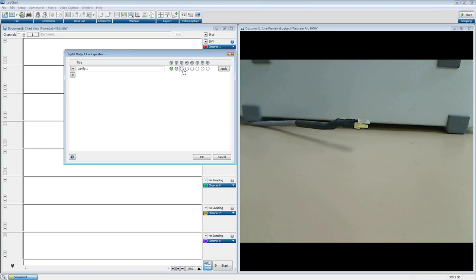Whenever I apply this configuration, I want that output to be turned off. White, which is the default setting, means do not change the state. So if I leave number 3 here with just the white selected, and let's say I have another configuration applied, it will leave it to whatever state it's in. So if it's on, it'll stay on. I'm going to create another configuration. We have 2 on, and we force 3 off. Create another one. We create 5 total configurations here. Oh, messed up that one. And I'm going to do a reset where we'll turn them all off. And this one is just going to show you what happens with the do not change state. So on, off, do not change state when it's white.